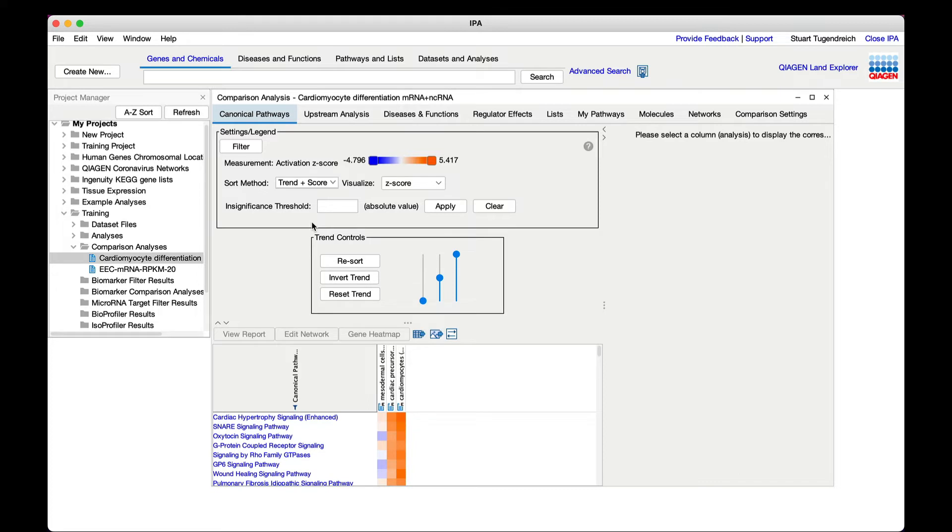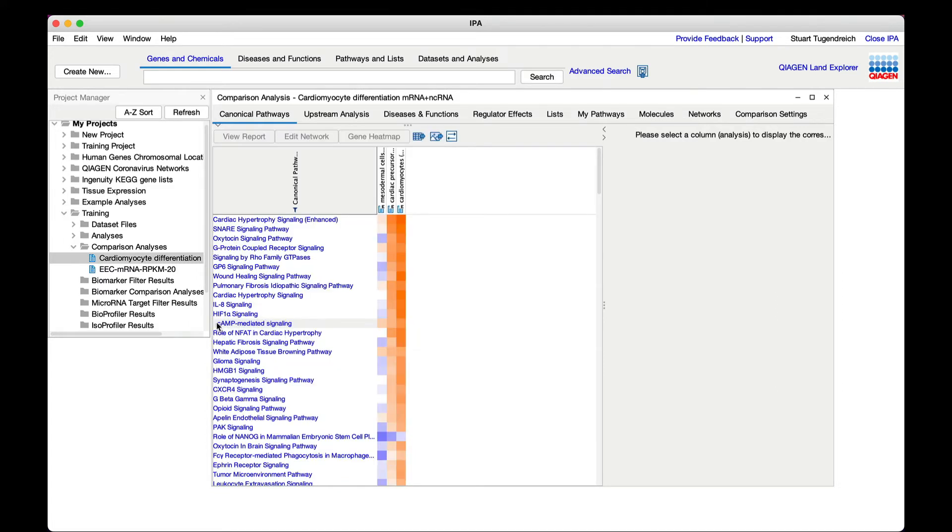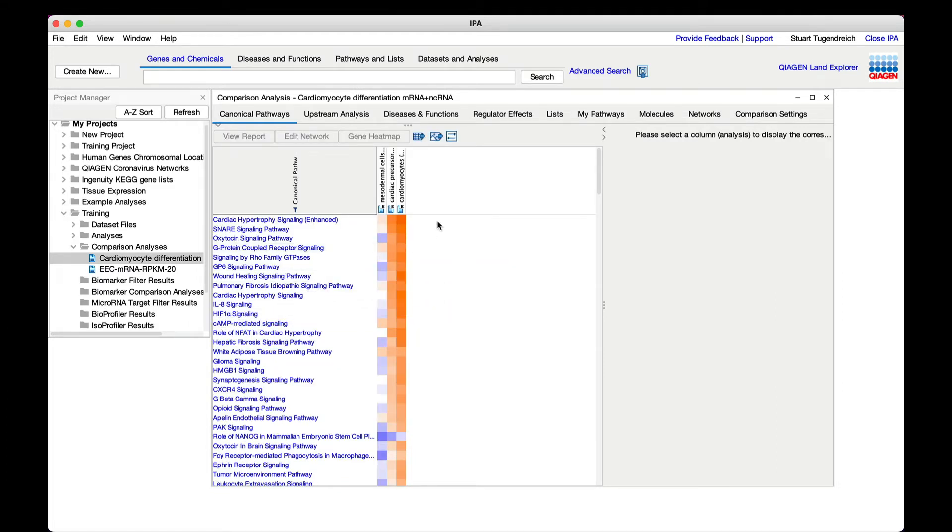And adjust the sliders if necessary to surface the pathways that show a trend of increasing score from left to right. Since the analyses are already arranged in the order MES, CP, CM from left to right in the saved comparison analysis, this will result in prioritizing the entities that are predicted to be increasing during the differentiation program.